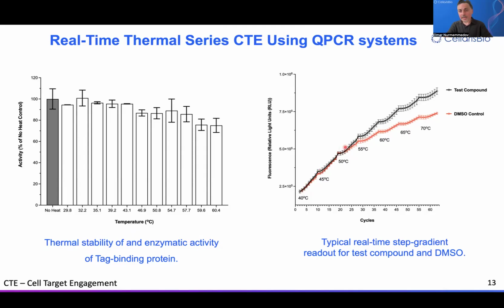You would see where exactly it starts deviating from the baseline. In this case, that's 55, perhaps 53 degrees Celsius, when it starts to plateau and when the signal stops generating. And then you have area under the curve for your potency of engagement measurements.